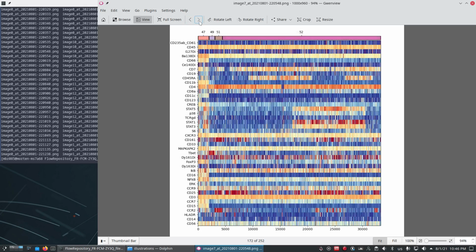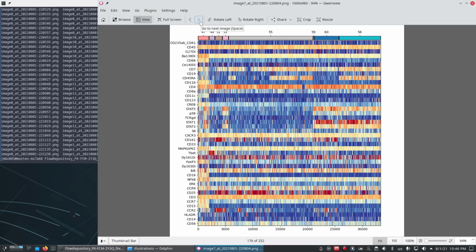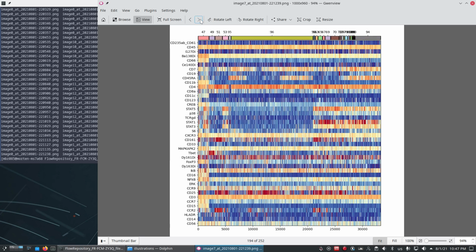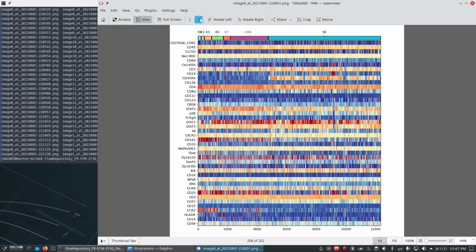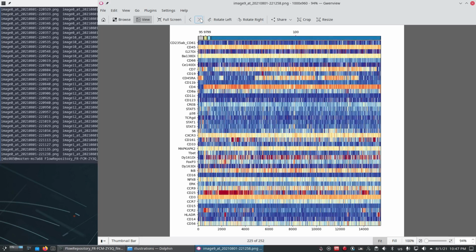So they're all here, and there's nothing really to do for me now. I have to make these images available, and then you can in ease and quiet have a look which of them you like and what is happening every time we make the clustering a little bit finer. And then for your publication, you can pick out exactly the illustrations you think are appropriate. So there's lots of illustrations. So we're getting to the end of it.